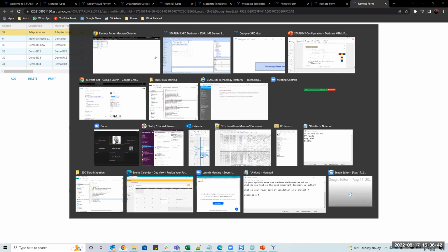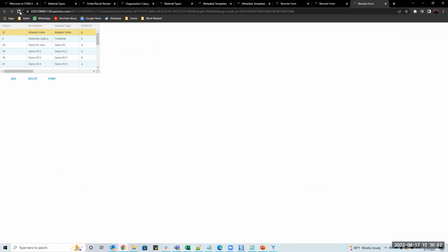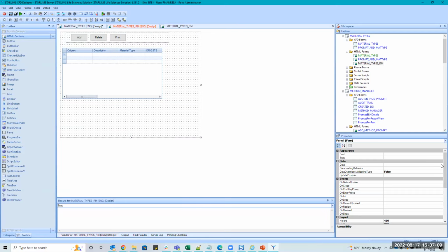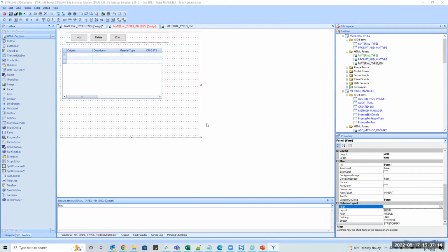Yeah, you see, so you have to reverse your logic here and you have to send it to the back. That makes it so that this control is going to appear in front of this one. So if we try to do this again, it should hopefully line up a little better. Yeah, okay, so this is what we want, right? Or kind of what we want. You see the grid doesn't really cover the whole page. So why is that?